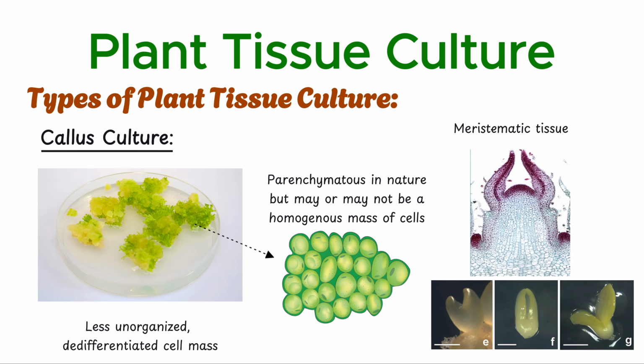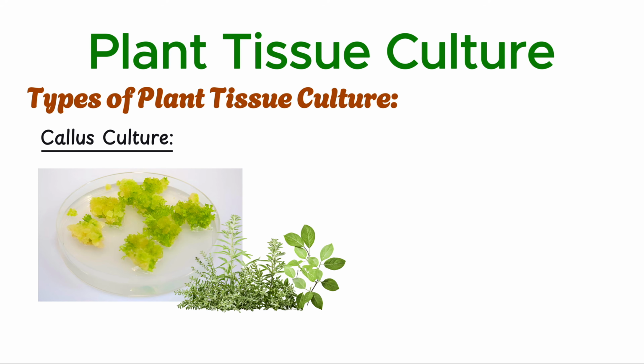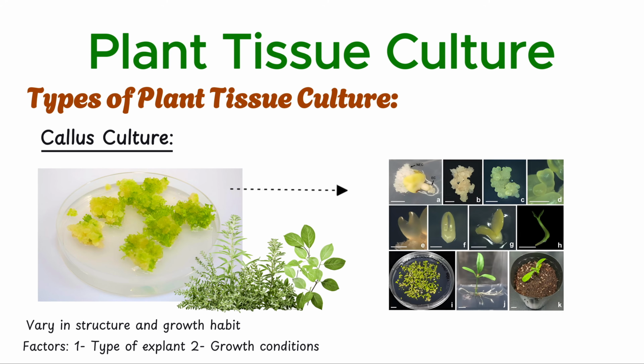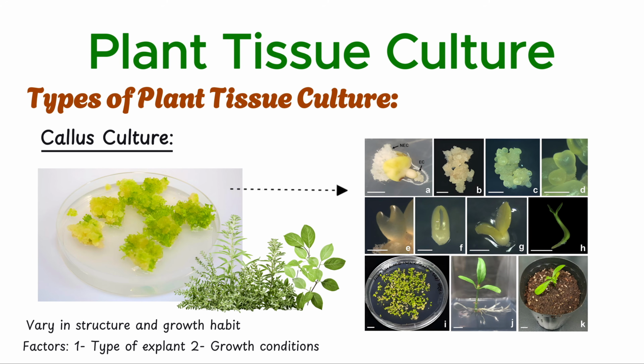The callus tissue from different plant species may vary in structure and growth habit. The growth of callus depends on factors like the type of explant and the growth conditions. After callus induction, it can be subcultured regularly with appropriate new media for growth and maintenance.